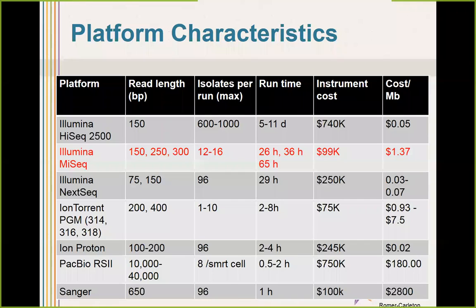For example, at the New York State Department of Health Wadsworth Center Laboratories, they have a NextSeq where they are running all salmonella, but need to wait until there are 96 isolates for a run. Previously, they were using a MiSeq that could be filled up faster and run more often, but was more expensive per read.